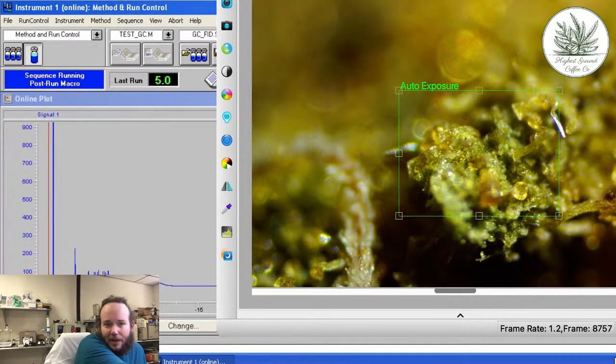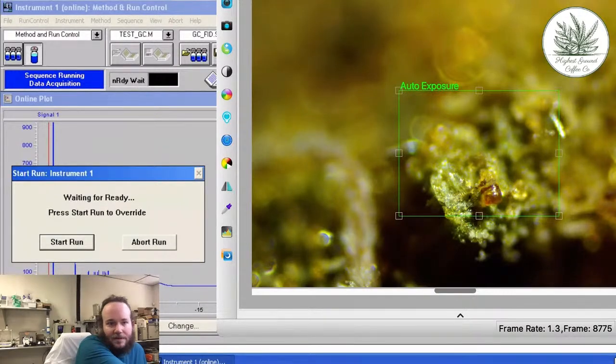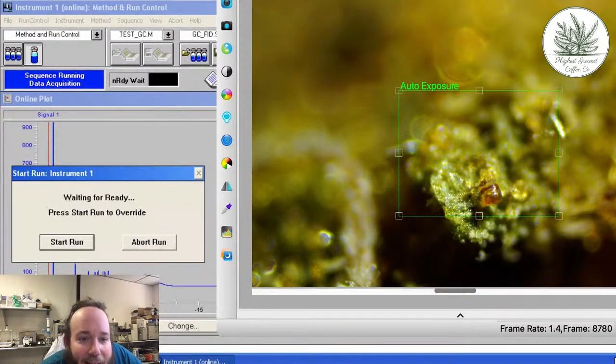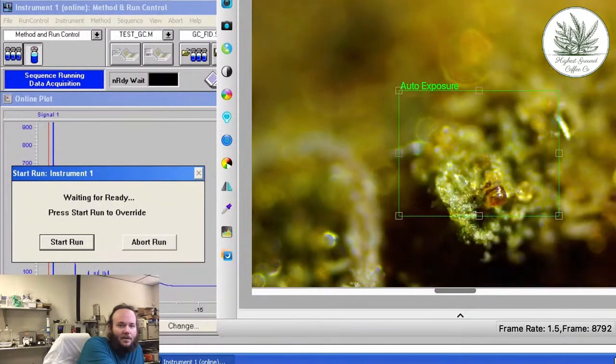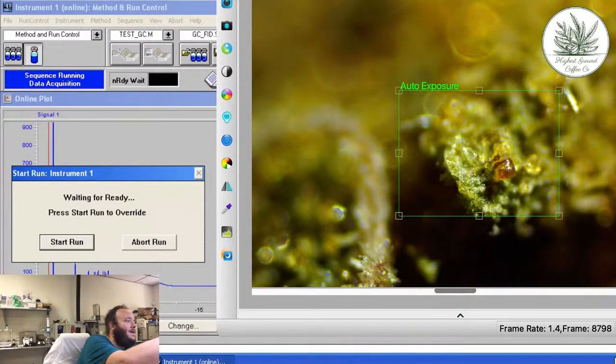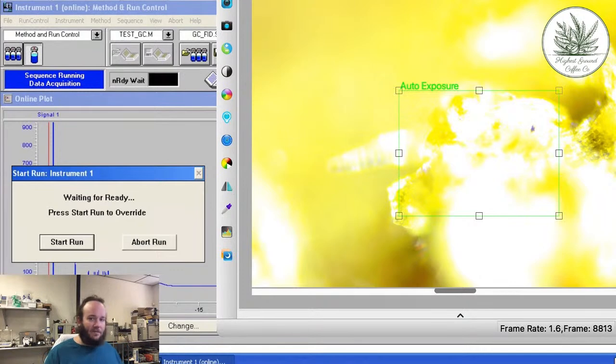So this is a cool shot. I want to get the very tip. There it is. That looks great. In fact, I want to center. Oh, that wasn't helpful. Okay. Now I'm going to switch from the whatever this is objective to the 10 objective. We were on the 4 objective before.